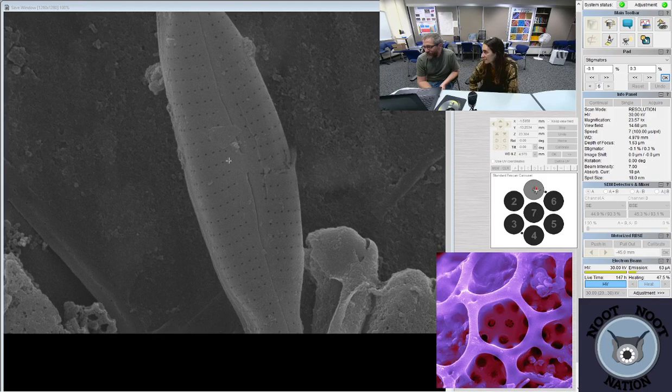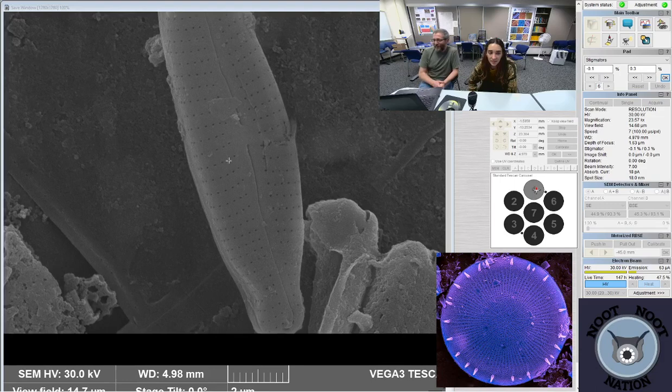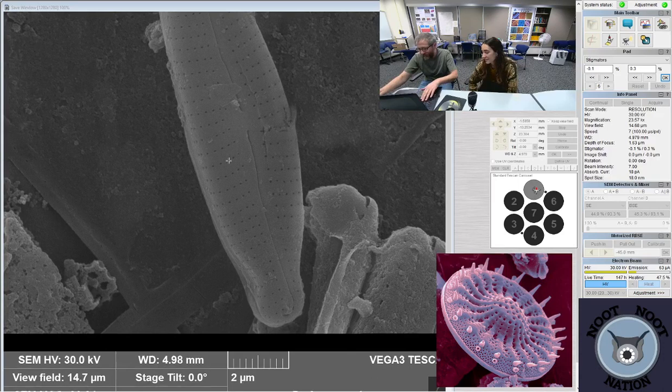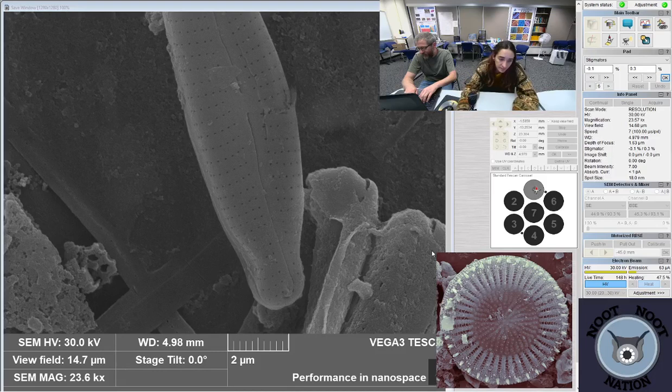I don't think it's a Gomphonema. It's not asymmetric in that direction. It's asymmetric the other way. I don't think it's a new discovery. I think it's more like, yeah, there is one. Let's see. It will be in Encyonopsis. Encyonopsis.